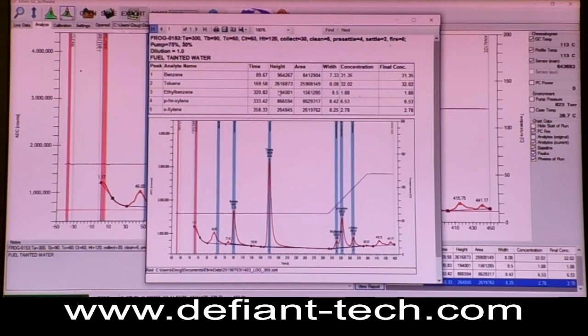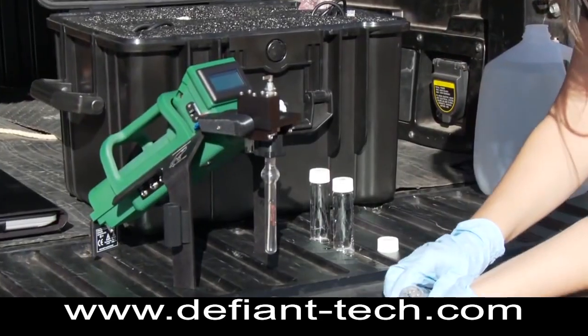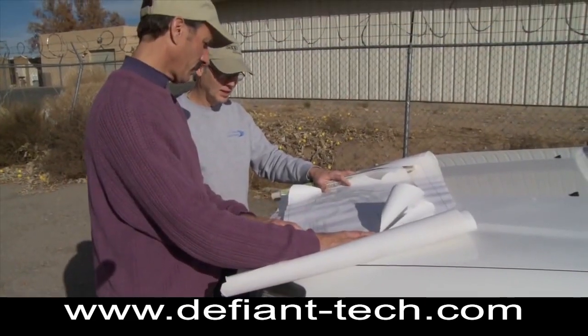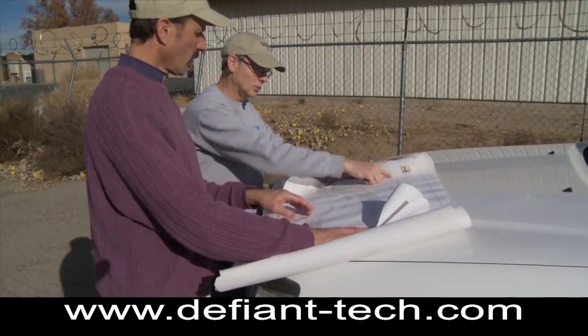They'll pop up and give you a report showing the chemicals and their concentrations. It's identified benzene at 31 parts per billion, toluene at 32, ethyl benzene at 1.8, and so on. This is a typical fuel type product that you would get from something contaminated with gasoline. Within 10 minutes you'll have an answer in the field, you'll know how your cleanup is progressing, and it can help you correct the job and fix it on the spot.